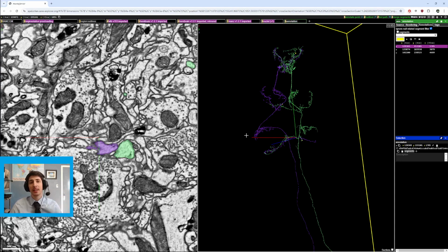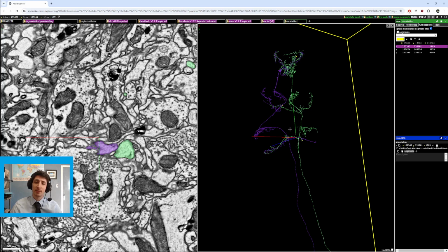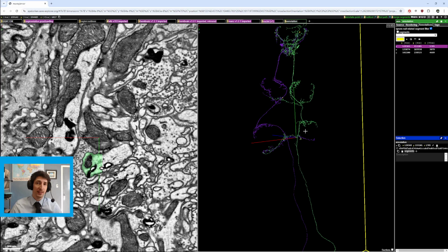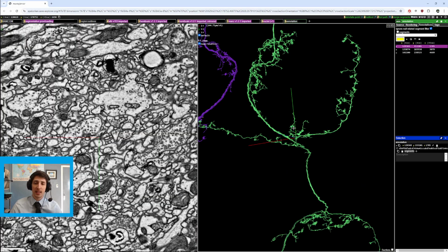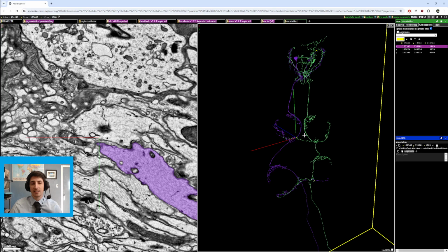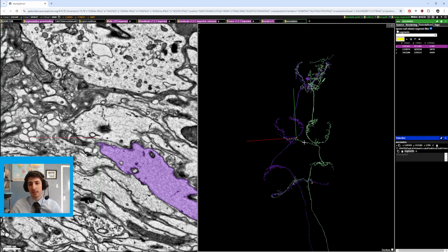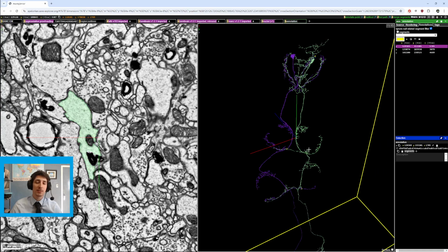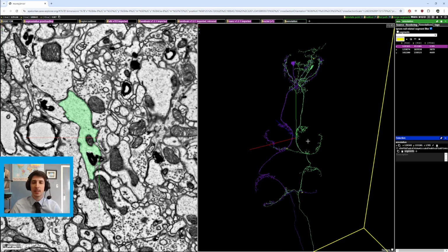What's going on, guys? Welcome back to another video, and today we are using Spelunker.cave, which is the newest Neuroglancer neuron viewing editing web page software that we use for proofreading. And there's some new features in this, so I'm going to make a few videos to go over just some tracing techniques, some proofreading techniques, and how to utilize these techniques to become a more efficient and better tracer.